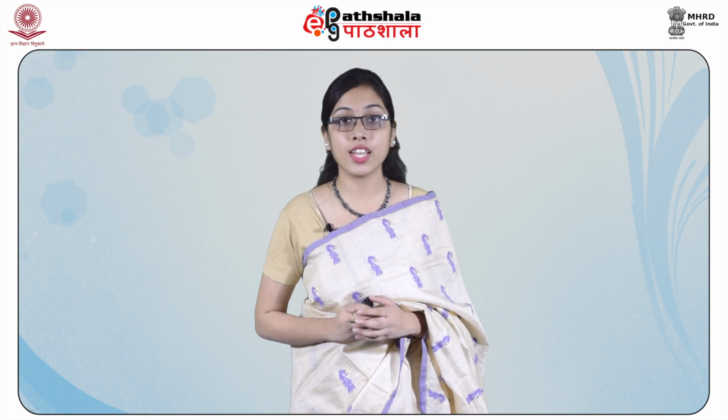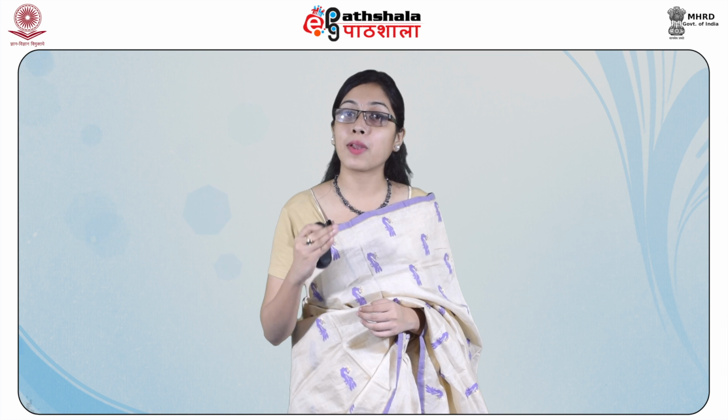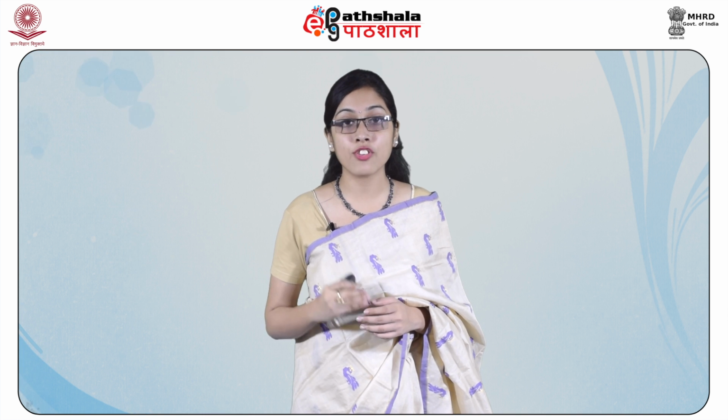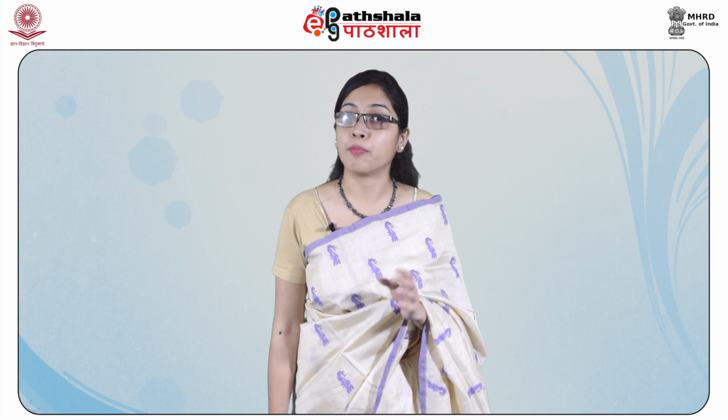Next is two-dimensional paper chromatography. In this technique, a square or rectangular paper is used. Here the sample is applied at one corner and development is performed at right angle to the direction of the first run using a different solvent. This facilitates better separation of the components of the mixture.